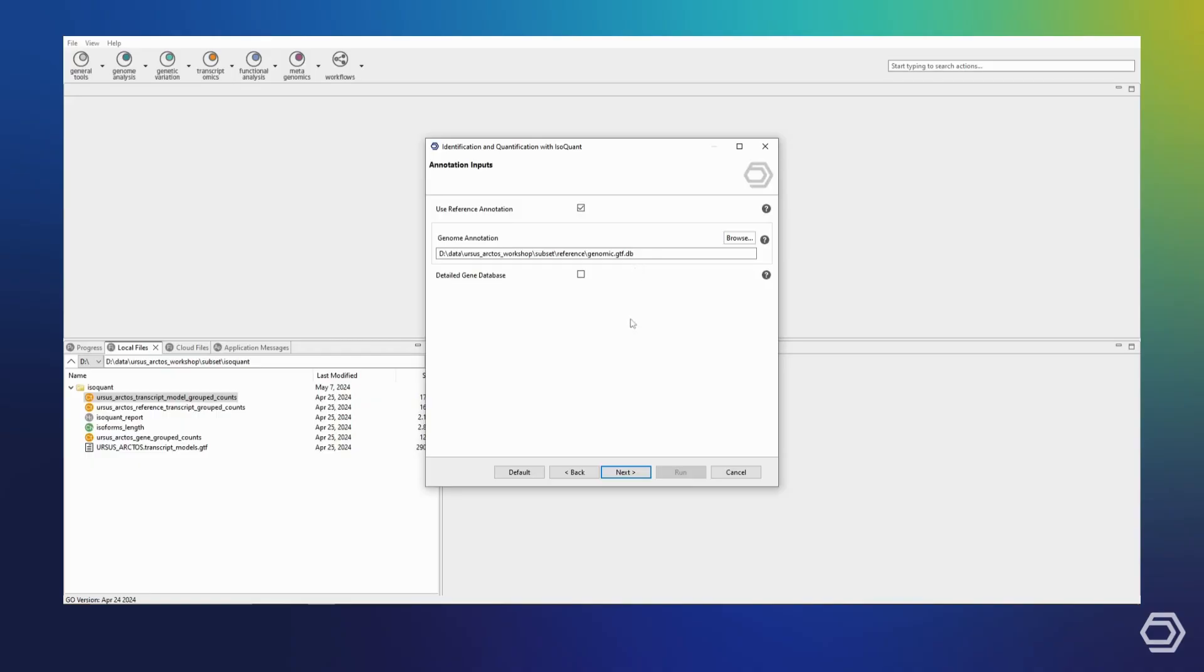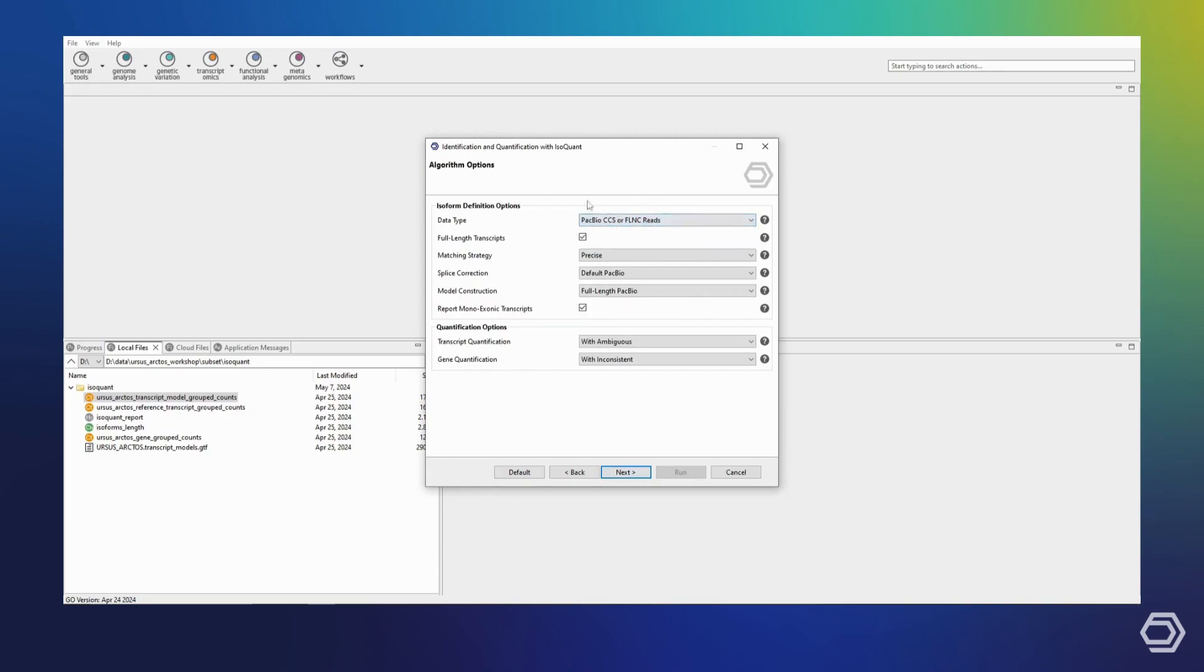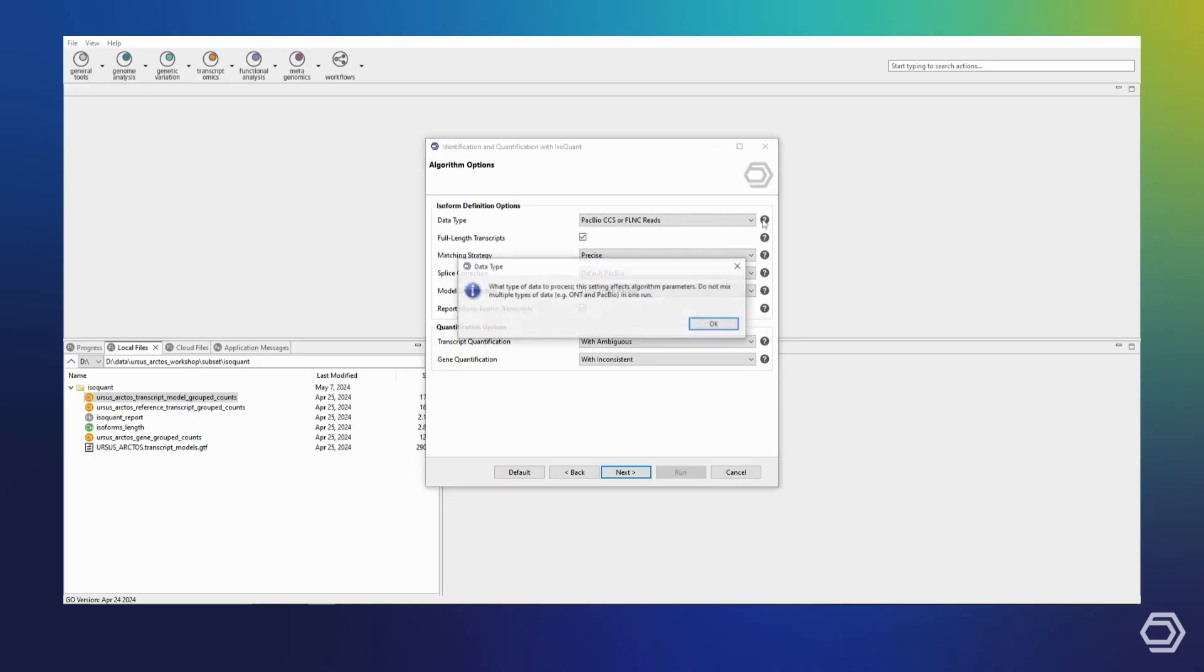On the next page, we can specify the algorithm options. I have already selected our data type, PacBio full-length reads, which automatically adjusts all of the other settings to fitting defaults. If you are ever unsure about any of the options in the wizard, you can always click the question mark icons for more information, or consult the OmicsBox user manual.